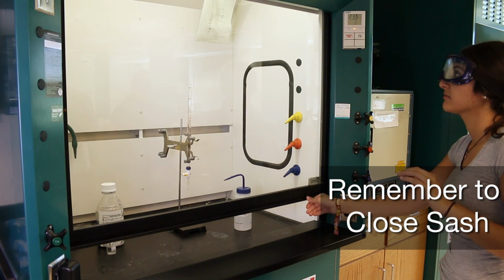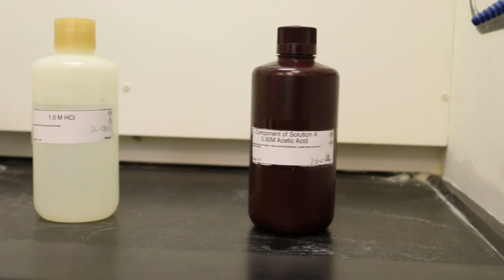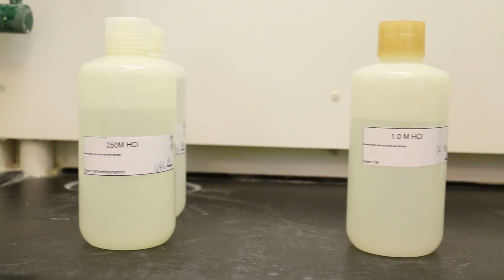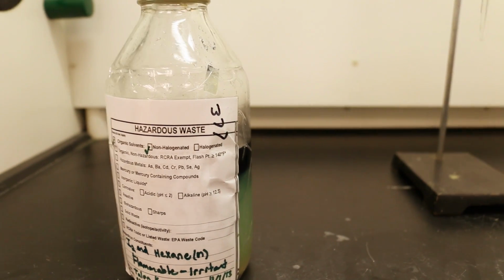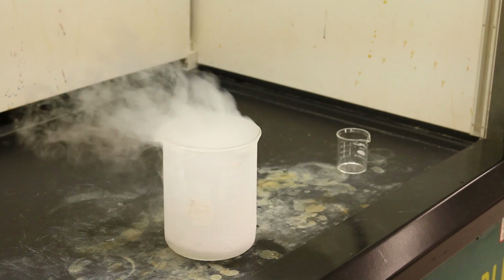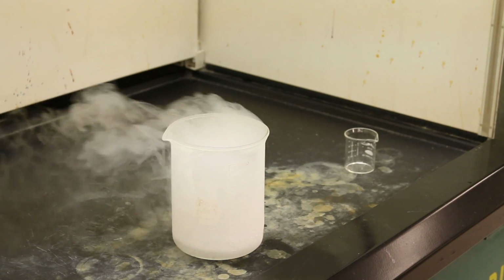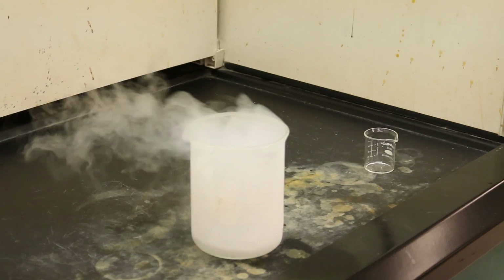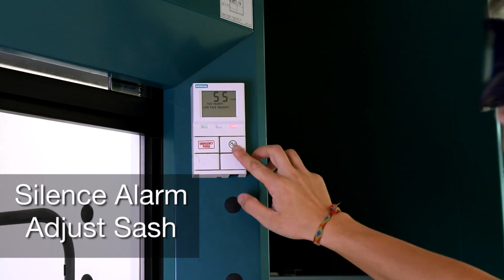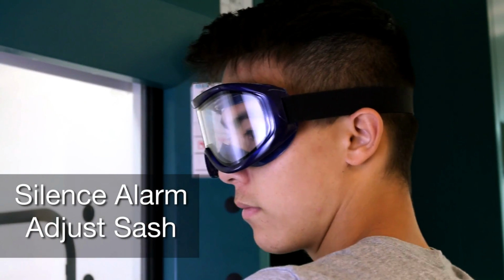This position saves energy. For many general chemistry experiments, concentrated chemicals will be distributed from the hood and hazardous waste will be collected in containers in the hood. Occasionally, the fume hood alarm may go off. This indicates that the sash may not be in the correct position for proper ventilation. If this happens, you may silence the alarm and adjust the sash. If it repeatedly goes off, make sure your instructor is aware.